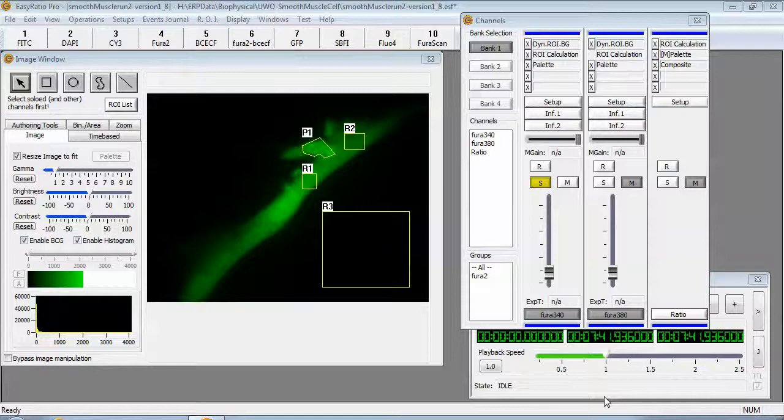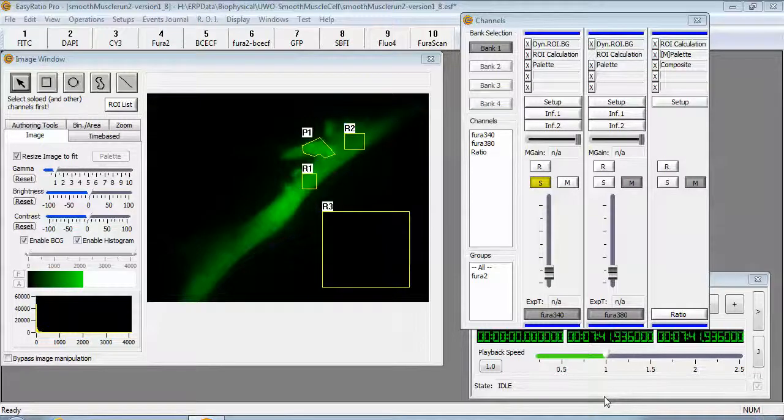This is useful for users who are Metafloor users that would like to do analytical processing using data that was derived from EasyRatio Pro.